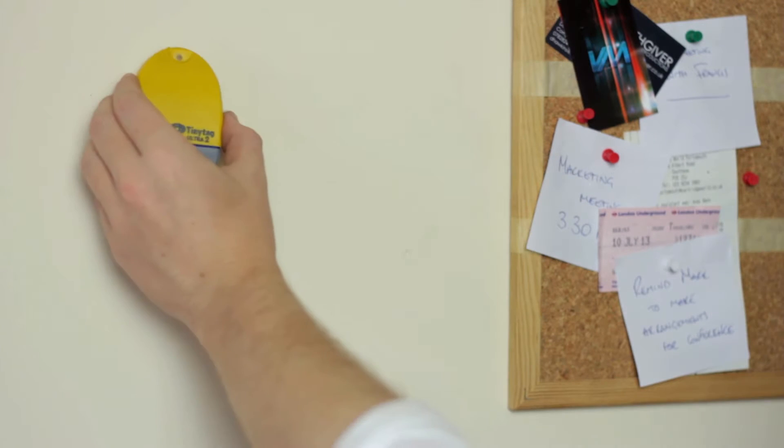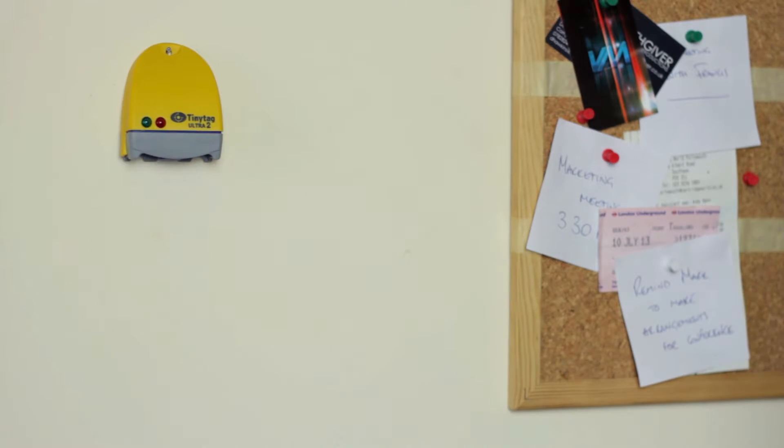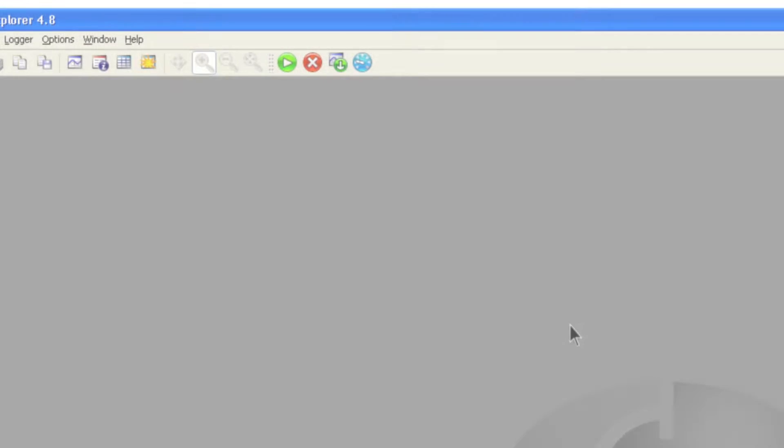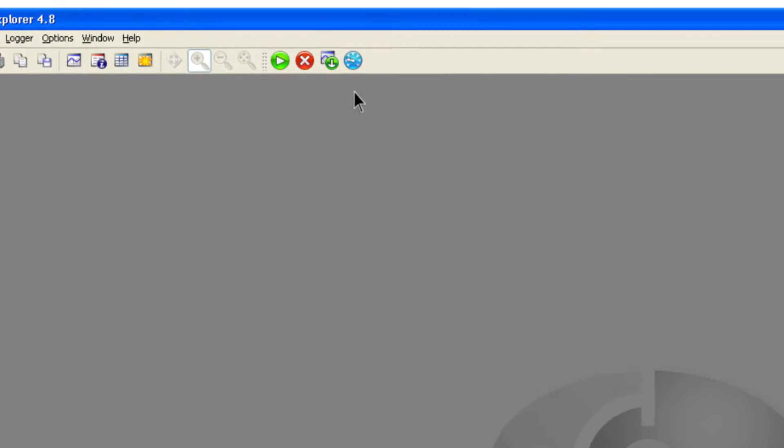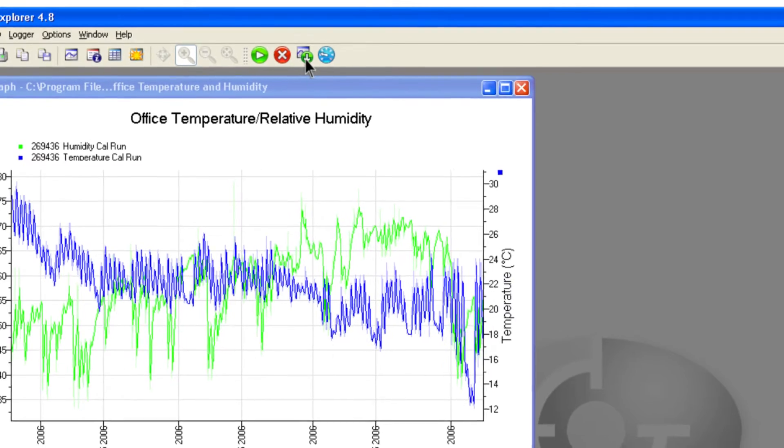Once this is done, the logger is ready to be positioned where it is going to record. When you wish to view the recorded data, connect it to the computer and click the get data option.